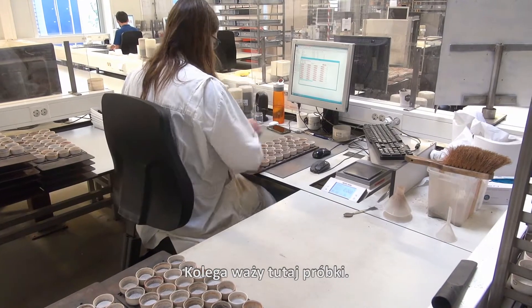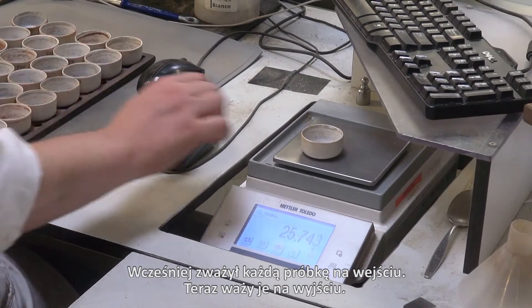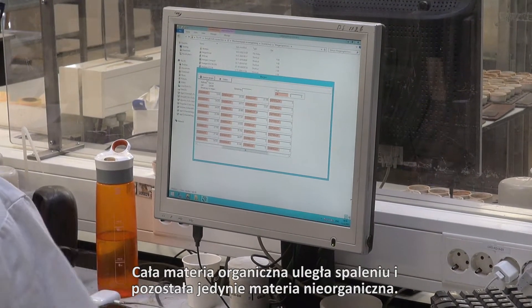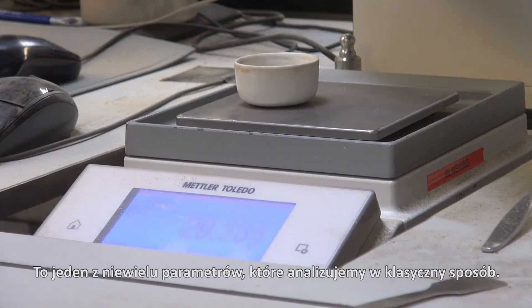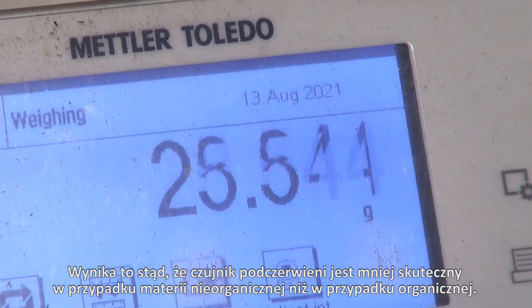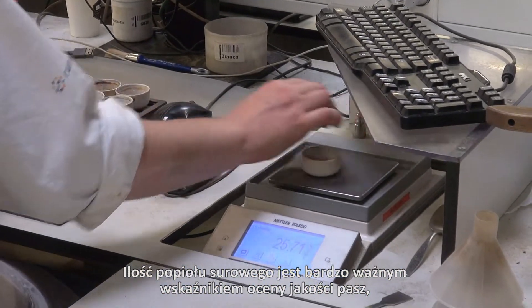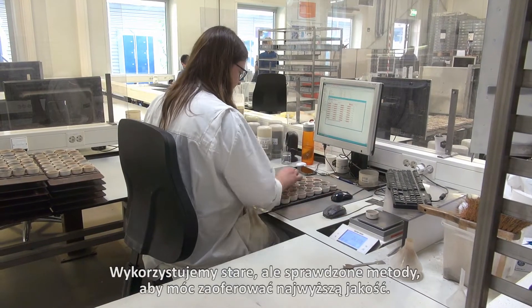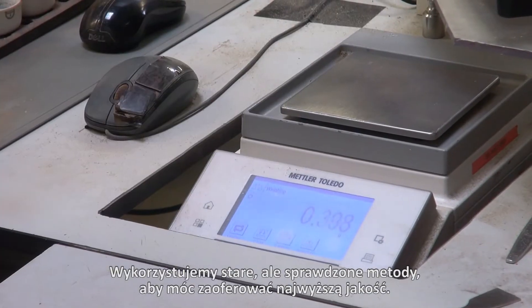At the moment my colleague here is weighing out the sample. We did the same before the analysis where we weighed in the sample, and now we're weighing out the sample. All of the organic material has been burnt away and only the inorganic material is left. If you look at the report, this is one of the fewer parameters we still do in the classical way, because the infrared sensor does not work as well on inorganic material as on organic material. And because crude ash is really important in feed evaluation like FEM or other energy parameters, we wanted to have the highest quality possible. That's why we still do this in the old fashioned way.